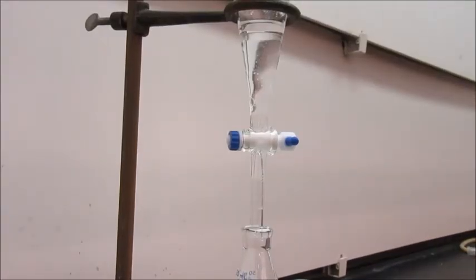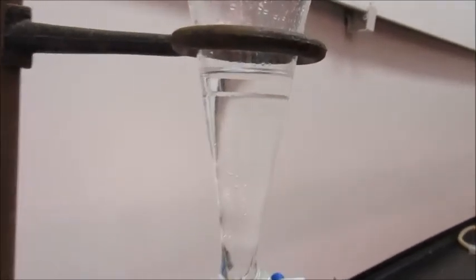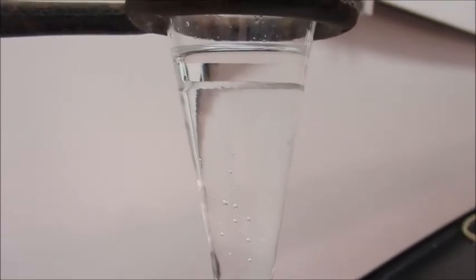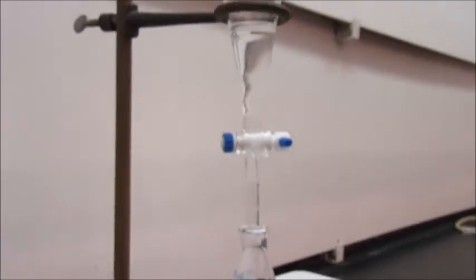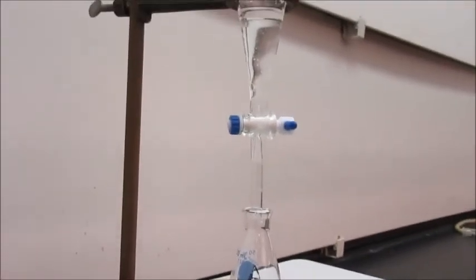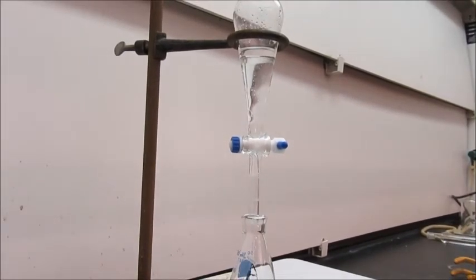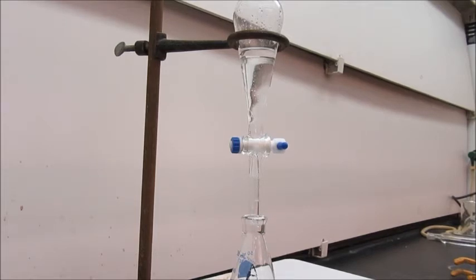I gave that a minute or two to settle. And hopefully you can see there are two layers in here. So I'm now going to separate those two layers. Again, I'm putting the aqueous in flask A, which you should be able to see there.